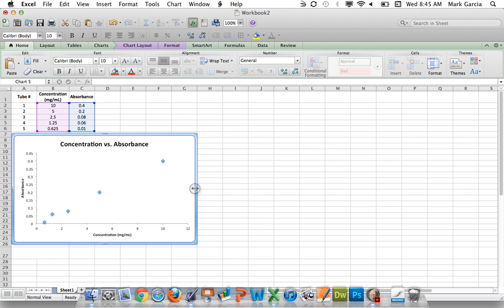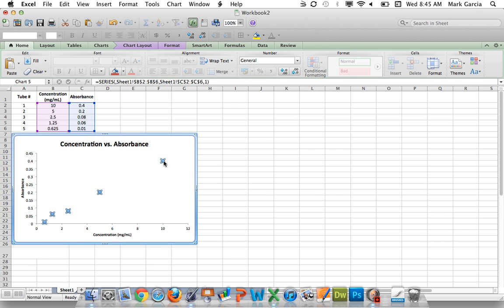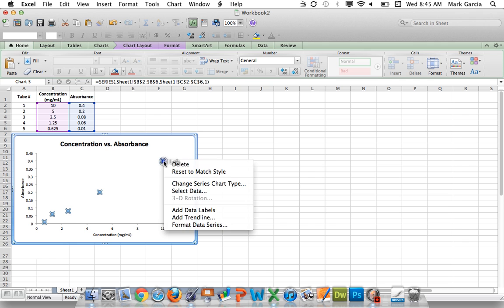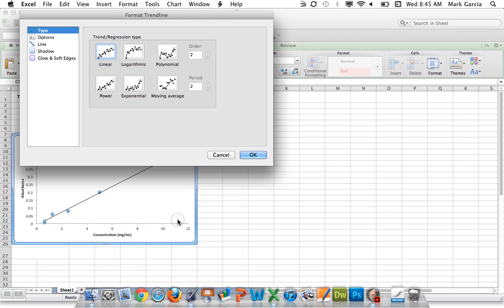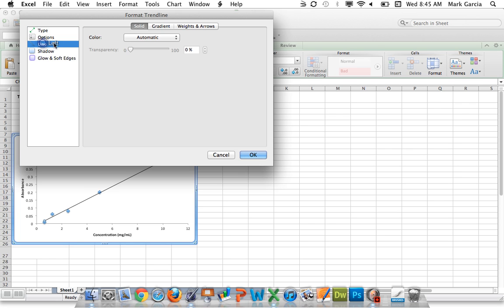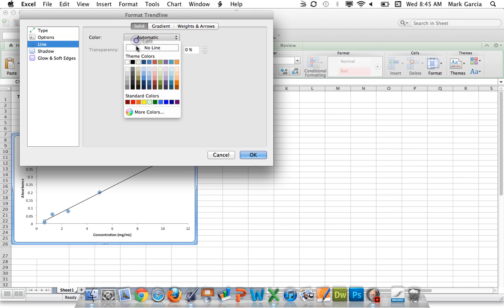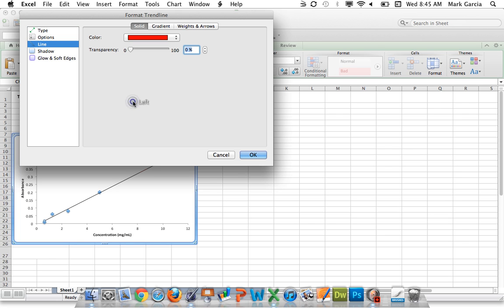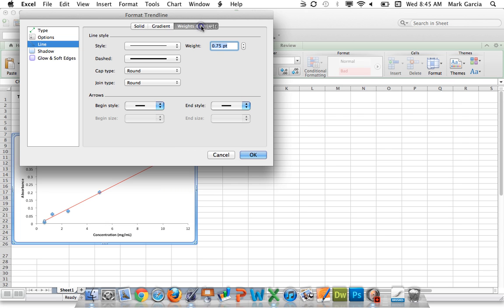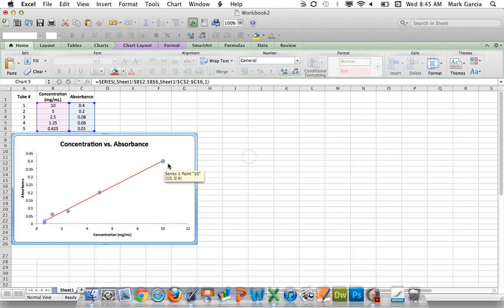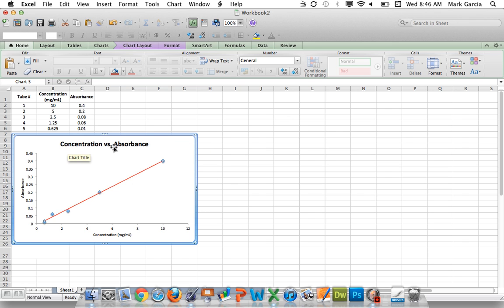Now what I'm going to do is I'm going to click on the data points, and I'm going to right-click, and I'm going to do add trendline. So that gives me a linear trendline, which is exactly what I want. I'm going to format the line. I'm actually going to make it red so it's a little more pronounced, and I'm going to click on weight and arrows. I'm going to increase the weight to 1.5 just to give it a little more heft. So there we go. This is nothing new to any of you who have watched my previous video on how to make a standard curve.